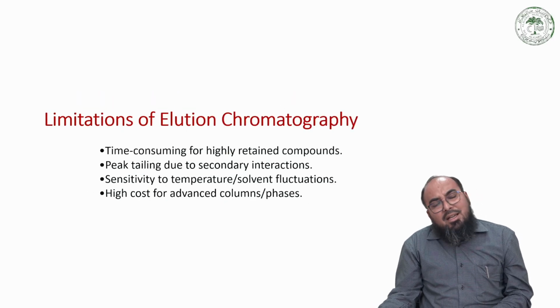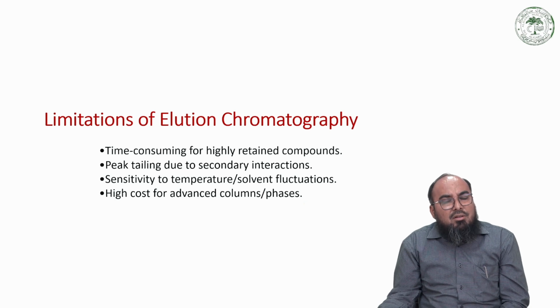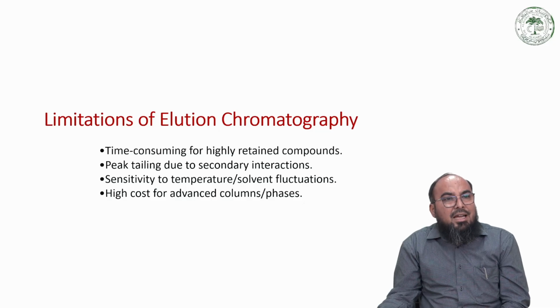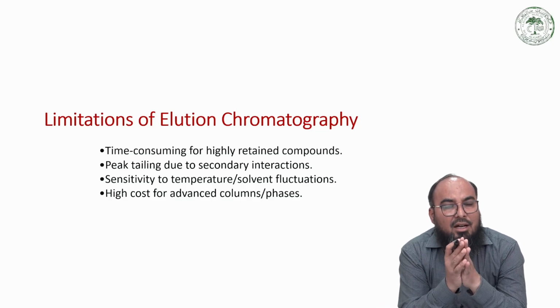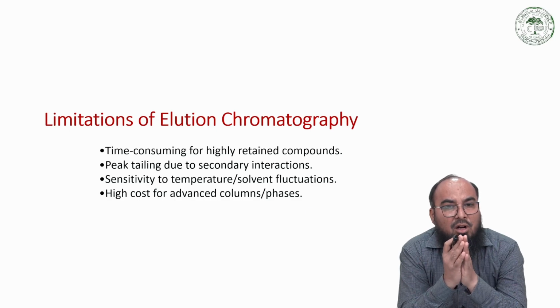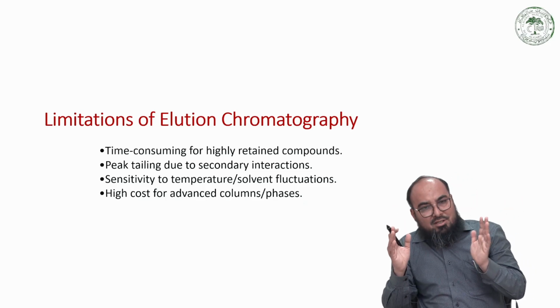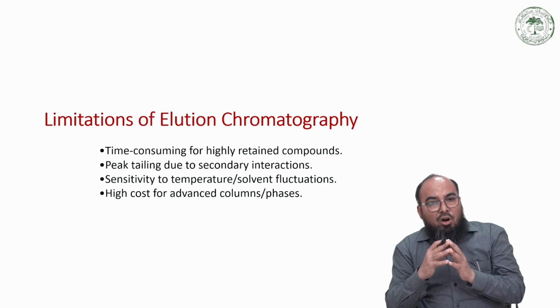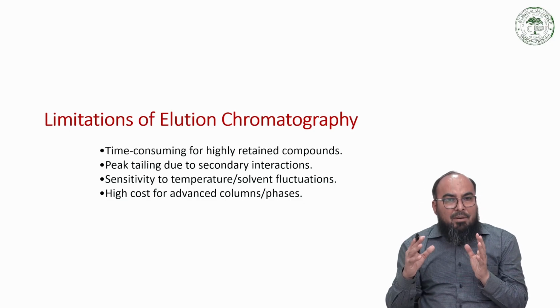There are certain limitations also. The first or foremost limitation is time. Sometimes it becomes very time consuming, because some of the components to be separated form a very strong bond with the stationary phase, and once they have a strong interaction, they are going to be retained for longer times, and this longer retention gives you a longer time for separation.